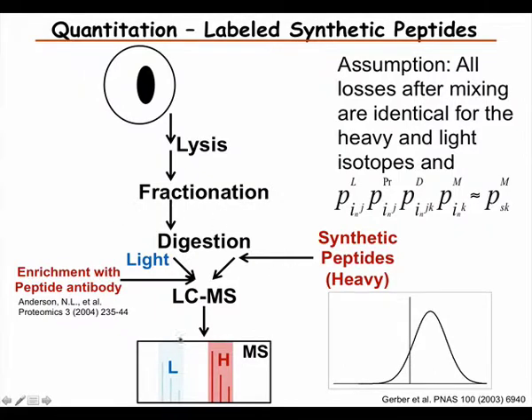So this has been proposed to be used to do absolute quantitation, to really measure how much there is of the peptide. But because of these problems, it still can be quite a rough estimate, and we can easily be off by an order of magnitude or two from the absolute quantity. But it's still very good for relative quantitation.